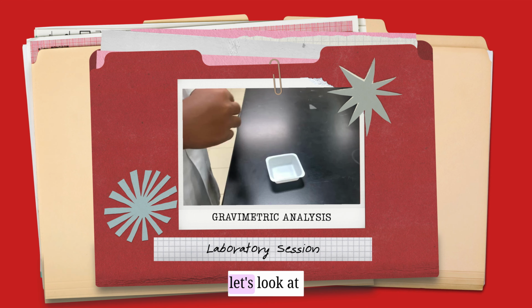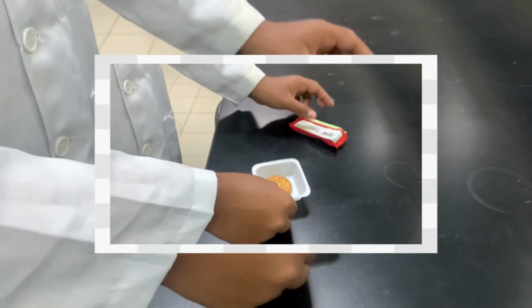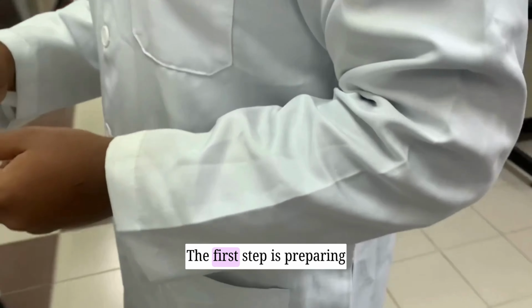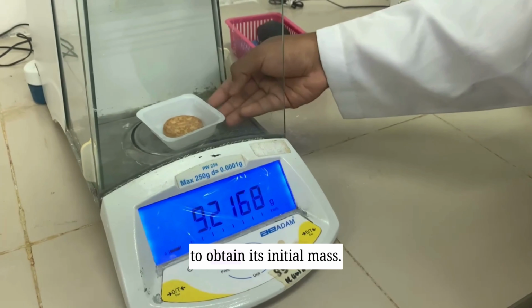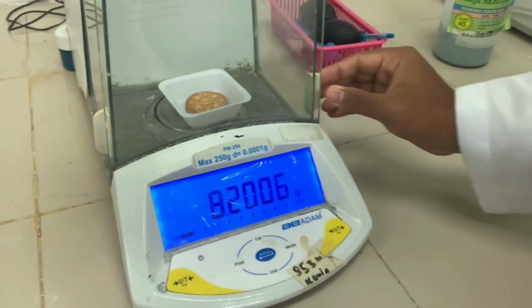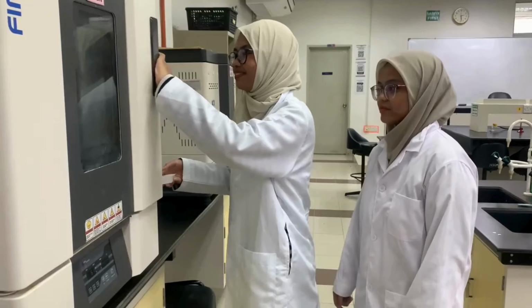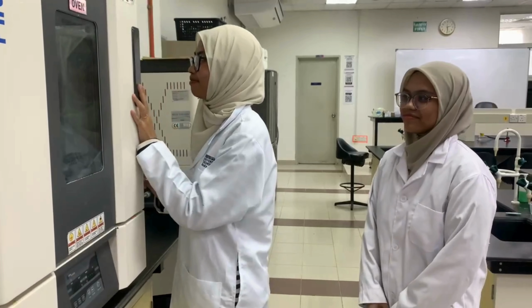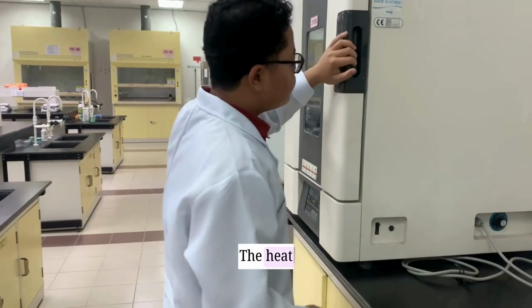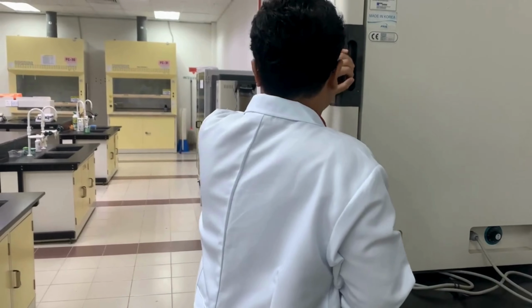Now, let's look at how this analysis is performed in the food industry. The first step is preparing the biscuit sample. The sample is weighed to obtain its initial mass. Next, the sample is placed inside an oven at a specific temperature. 24 hours later, the heat has removed the moisture from the biscuit through evaporation.